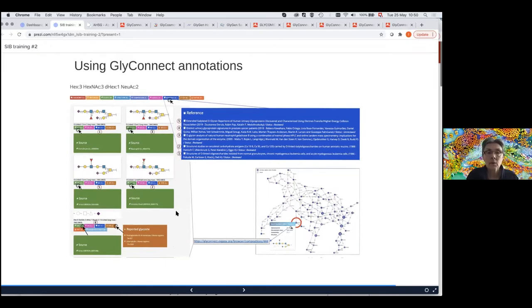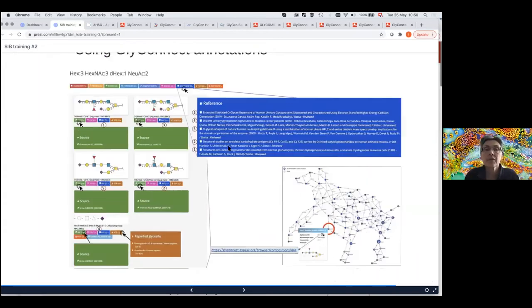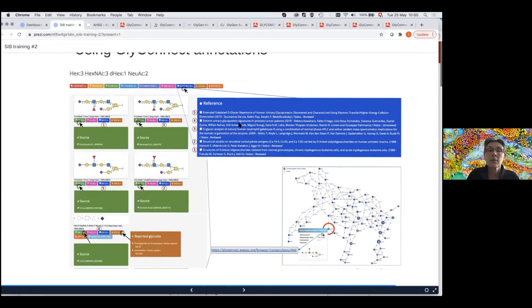In GlyConnect, we have the number of references — for this composition we have five references associated with it, and a number of proteins. This composition is reported in urine. I have some sites reported here: one is a glycoproteomics experiment, whereas the others come from glycomics experiments. What is interesting is that for this fucosylated and sialylated structure, the fucose is either alpha-3 or alpha-4 depending on the structure.